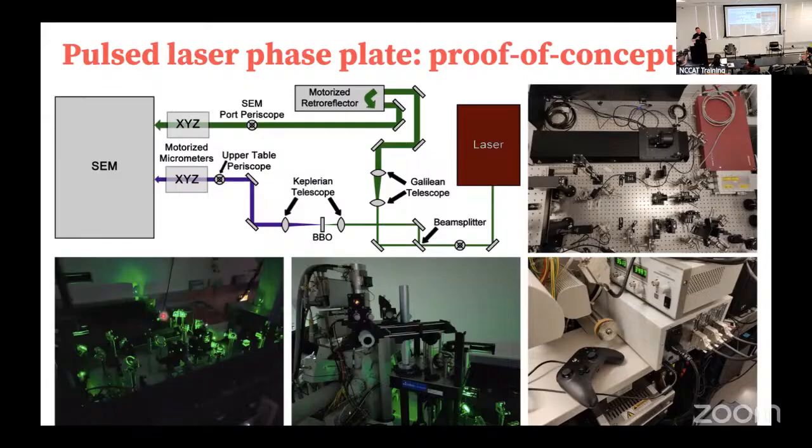So you have obviously a lot of green everywhere. This is with the lights off. The SEM itself is here, and those periscopes, telescopes. The SEM we had has a very small optical window, so you can see this kind of optical window through it, and you can see like a little piece of tungsten in there. That is your FEG tip. It's a Schottky tip, but it is zirconium oxide coated tungsten. And you can certainly see this bright light. It's like a little light bulb. So when you're hitting it with the UV, you're getting a lot of electrons coming off.